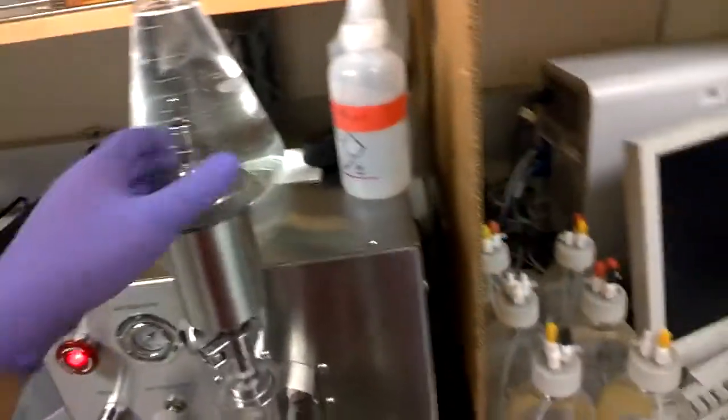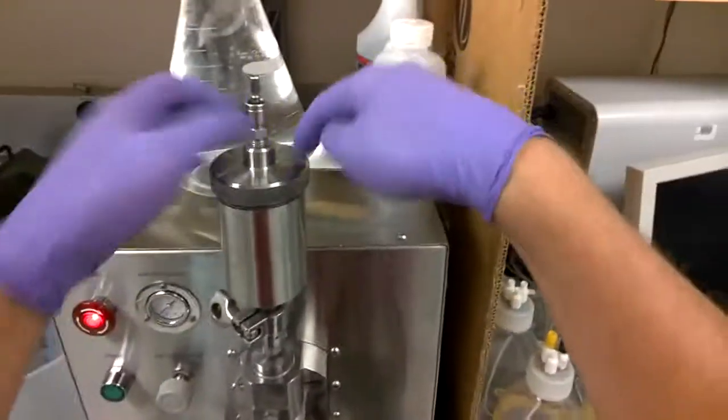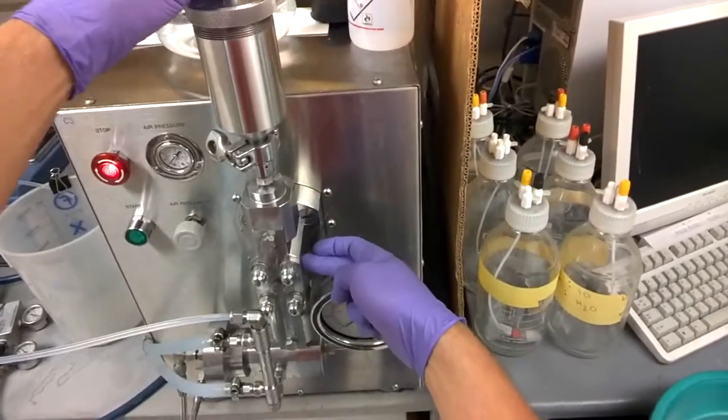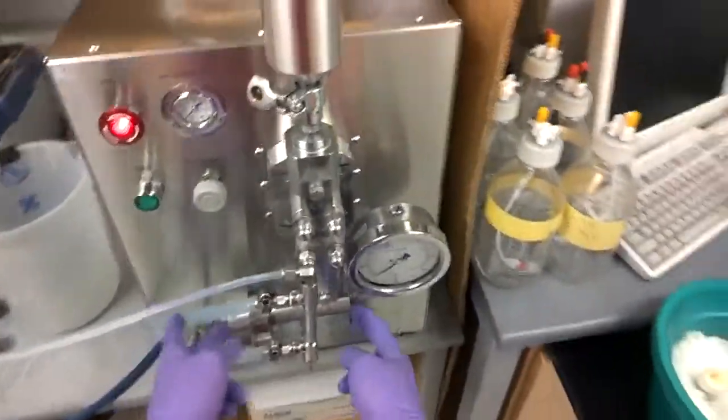So the way the Emulsiflex works is your sample goes into here, and then right there. And then there's a check valve, there's a pumping chamber here, and then another check valve, and this is where the actual license happens.